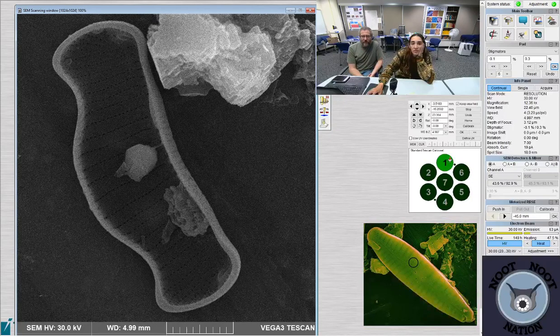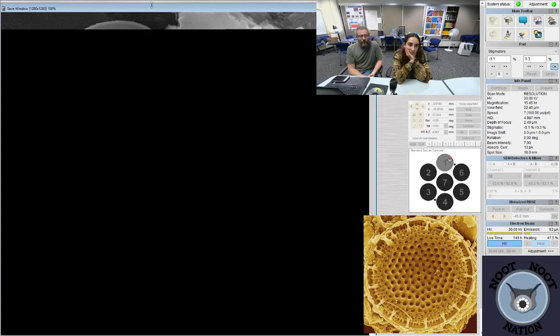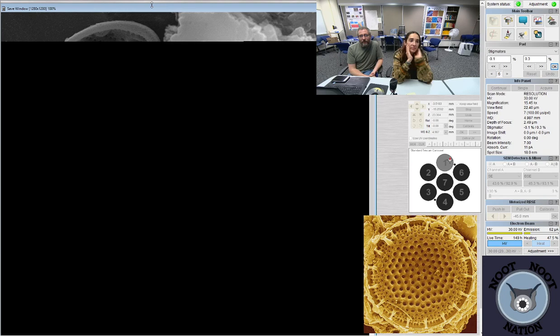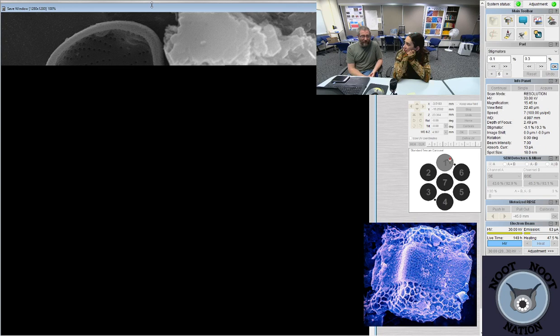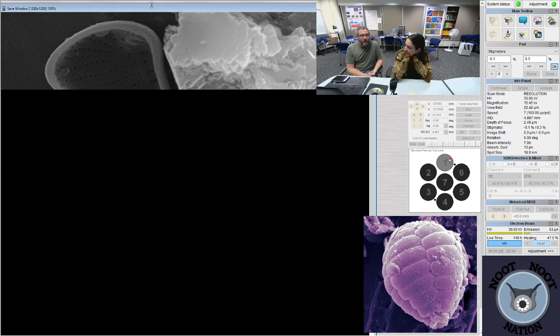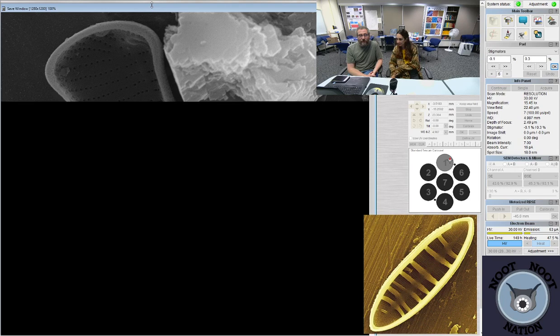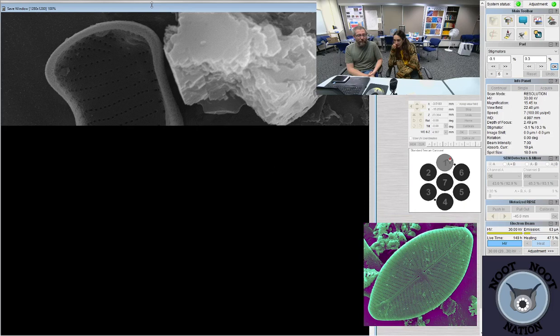The other cost associated with the SEM is the sputter coating, which is putting the gold on the actual sample. The individual targets cost about $800 to buy, but we usually use one for a whole year. So prorated over the number of hours that we use the instrument, it comes out pretty cheap. And the only other cost of actually running it, besides electricity, is the tungsten filament that I was talking about before. It costs about $60 for one filament, and they last us about 400 hours on this machine on average. So that cost also ends up being very small per hour.